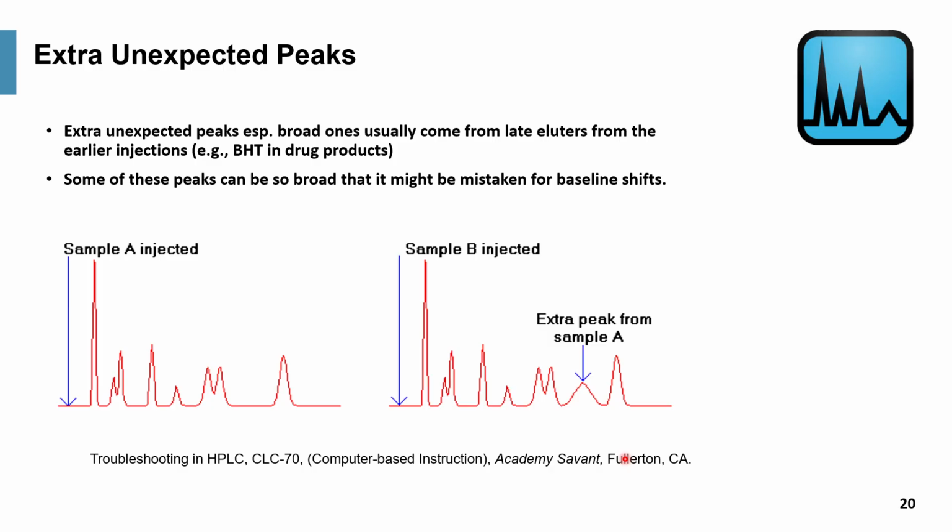You can program a wash after every injection, which is not ideal. There are assays where people would not use isocratic analysis because of problems like this, such as in bioanalytical, where they always do things under gradient condition for PK analysis and bioanalytical testing.